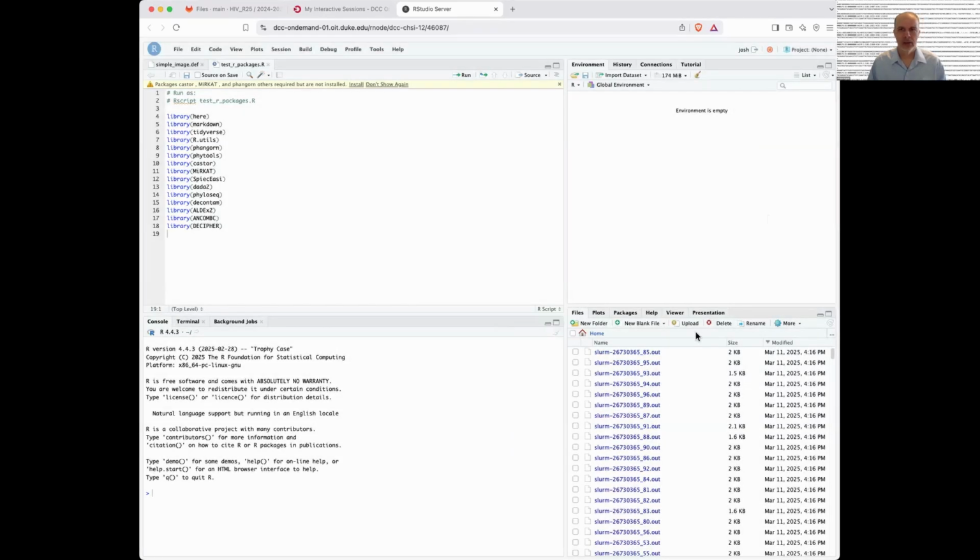It does not exist. Oh, okay. So I am going to clone the repository. Does anyone not have it, either because they're already in the 2024, 2025 HIV workshop, or they've found it in the menu?